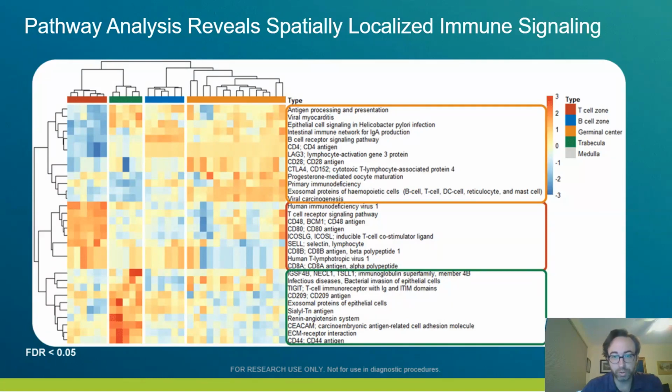And so you can start to look through this list and see some really interesting biology that may not have been able to fall out at the individual gene level, but might be more apparent when you're looking through a gene set ontology here, whether that's how the tissue would respond to a viral infection, whether that's maturation of B cells or CD28 cross-ligation.